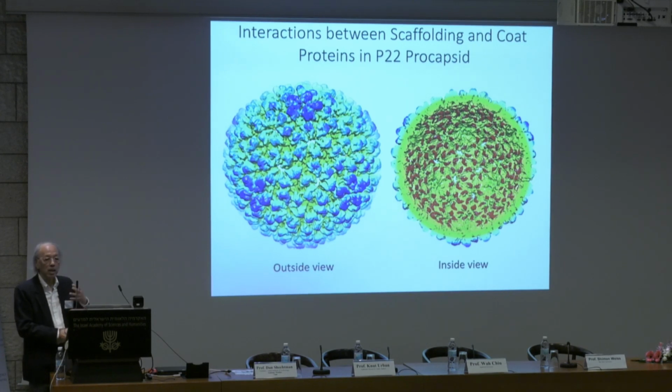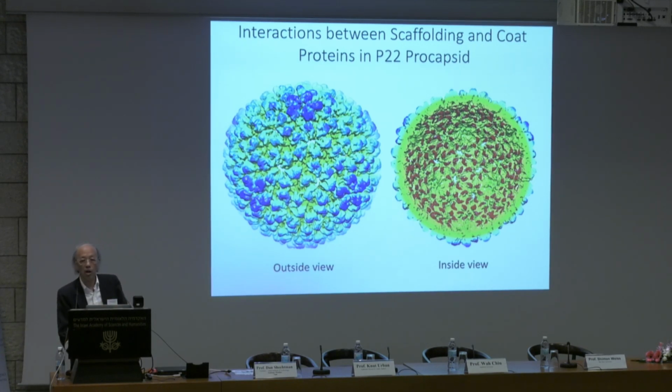By examining closely, the scaffolding protein is exactly in contact with the N-termini. As you remember in the movie, the N-termini move. The reason they move in the maturation is that when the DNA comes in, this scaffolding protein has to go out because there's no space for it. There's only a certain room inside the capsid particle that can hold either the scaffolding protein or the new DNA coming in. In fact, some of these holes you see in the procapsid, the DNA only comes into one of the 12 vertices, but the scaffolding protein actually gets out from all the 60 hexagon subunits.